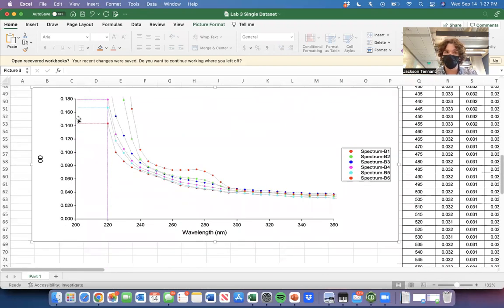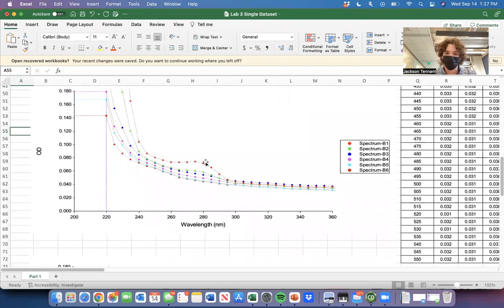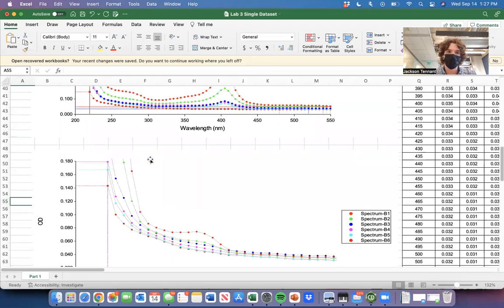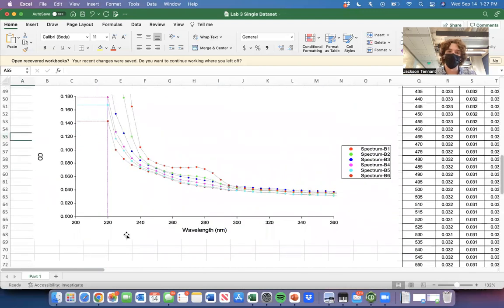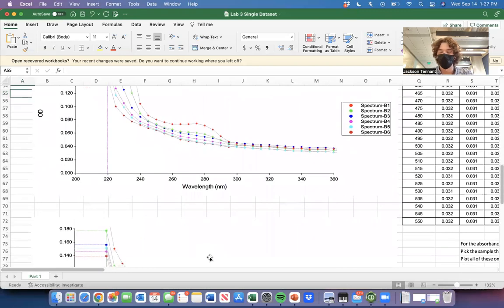This is the third sample, which is bovine serum albumin. It's just again a very standard, run-of-the-mill protein. It's used for a lot of things. It's used in the Bradford assay that we'll talk about in just a little bit. But again, we see the dropping down of that absorbance at 280. This noise here at the lower wavelengths is a result of those UV plates not being fully UV transparent. But you can still see that 280 is more or less the lambda max for the sample. Lambda max just means the wavelength at which maximum absorption occurs.